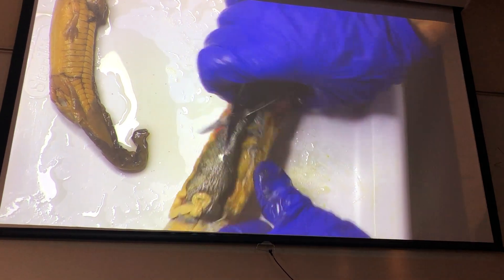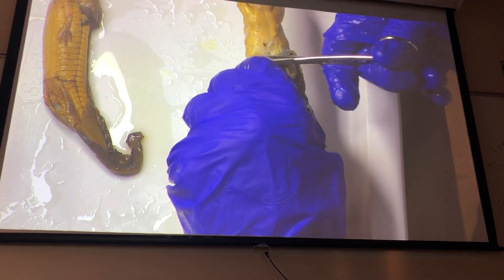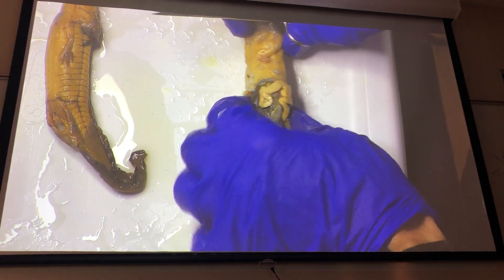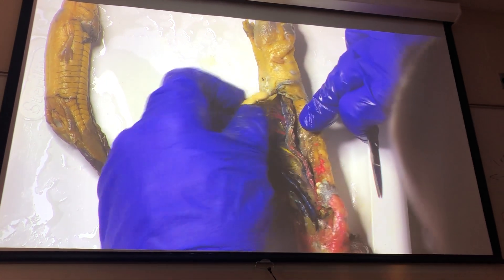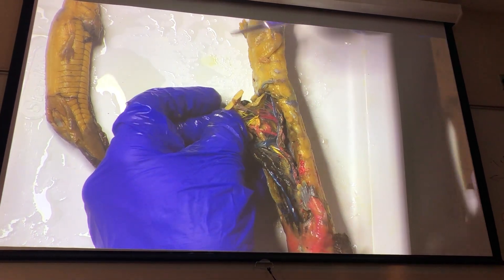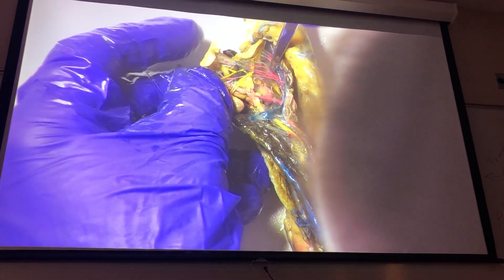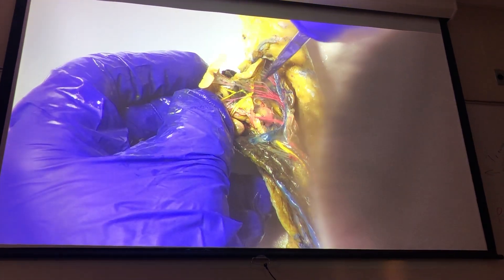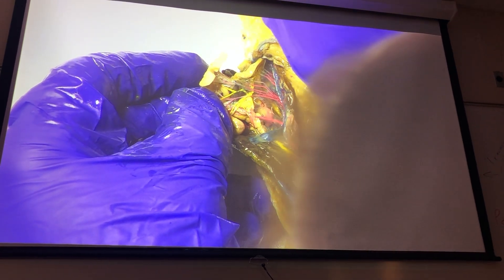This is going to be similar to what we saw with the shark, where most of it is going to be just clearing away the peritoneal folds and tracing things. The peritoneal folds are a little prettier on these animals. Just go in and open that up — very gently. You can't clean the blood vessels more than that on the shark or the mud puppy. Their vessels are very, very fragile. If you try to clean them, you're just going to destroy them. So you just trace them out.